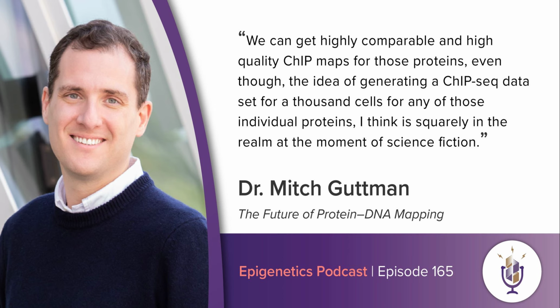In a method we've been calling ChIP-DIP, SPRITE with IP done in parallel, we can map, for example, many different proteins using the same ChIP-DIP approach, as well as the spatial 3D interaction of DNA. We can also incorporate this with, for example, RNA-seq transcription levels by mapping RNA within the same chromatin, on the same beads, in the same chromatin contexts.